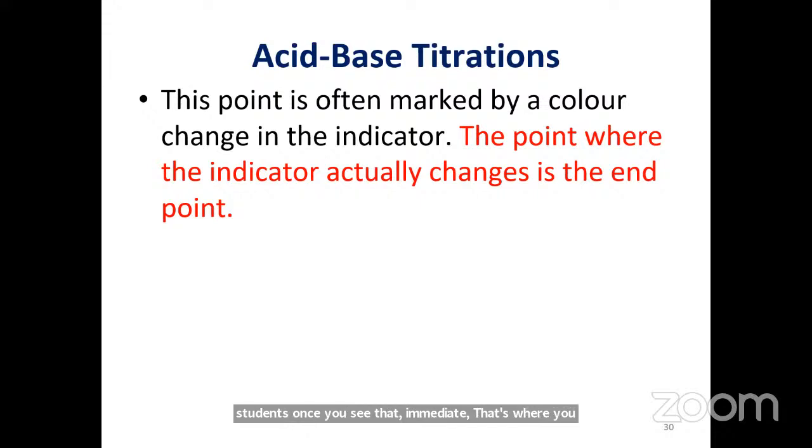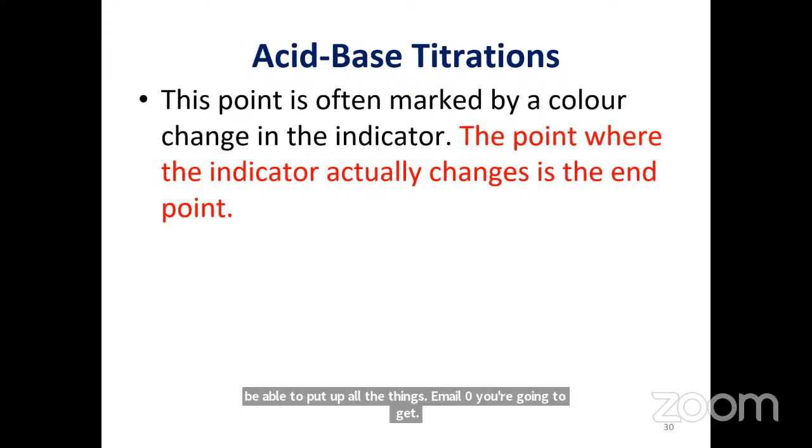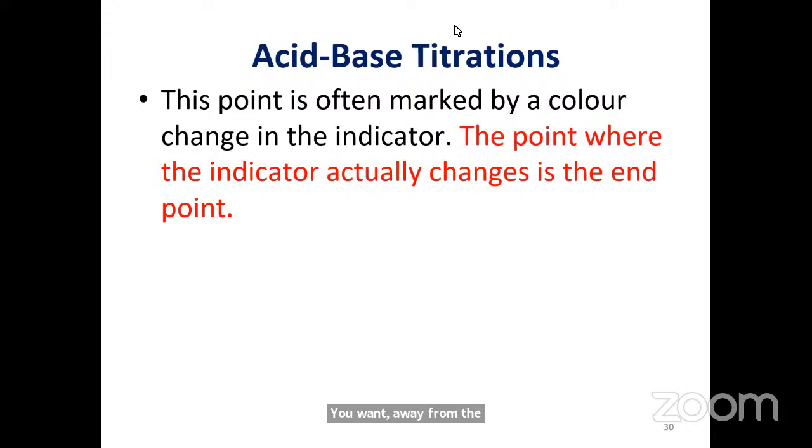But if you are looking for a beautiful color, the more zero you are going to get. The more you are tilting away from the endpoint, and that is dangerous for us. You begin to wonder, they gave me a low mark. You get a low mark once you are looking for a very beautiful color.